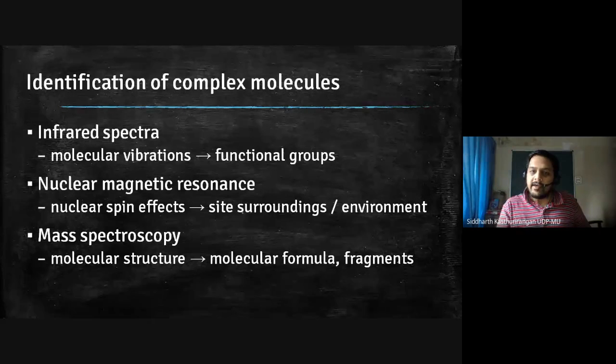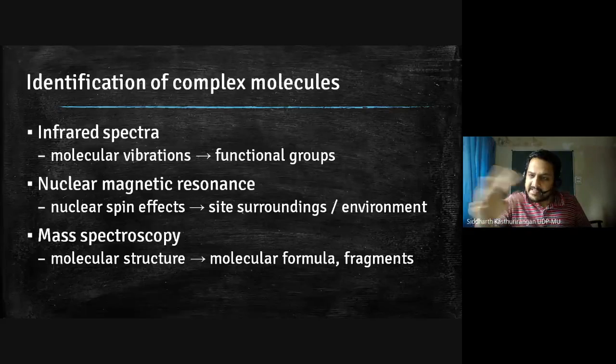So this is more like you are getting the physical features of that particular molecule. Yes, its terrain is like this. So that is like seeing a different feature of the map, not particular landmarks but general land formations. For example, if you have a map of Maharashtra, you will see Western Ghat somewhere, you will see coastal region somewhere. So NMR gives you that type of information. So neither infrared spectroscopy alone nor NMR alone is capable of giving you complete information about the molecule. Many times you need to do both in correlation.